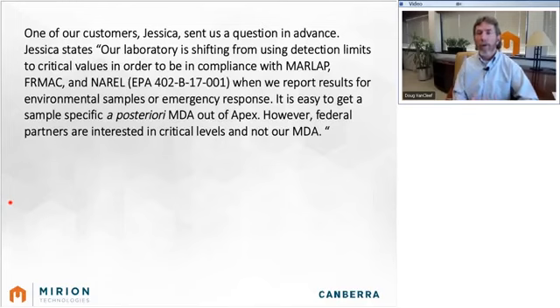Now, if you're using scintillators for your gamma spectroscopy, then you're going to naturally have some drift, especially if you have temperature changes. And then the answer is really the same. If you take a detector, for example, out of a laboratory into the field and you have a change in temperature, immediately before and after the analysis measurement is made, you should do an energy calibration check so that you can at least quantify any changes in peak position during that analysis period.